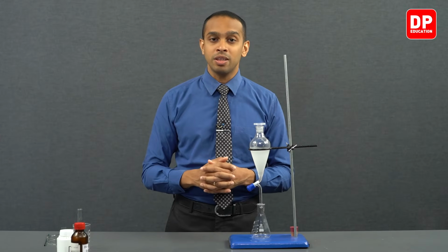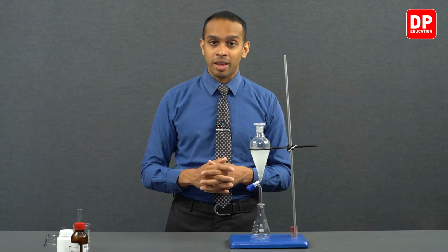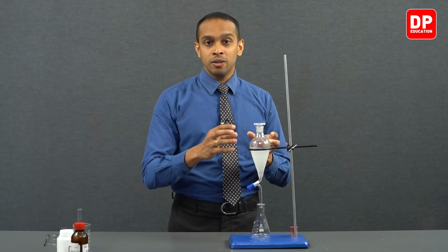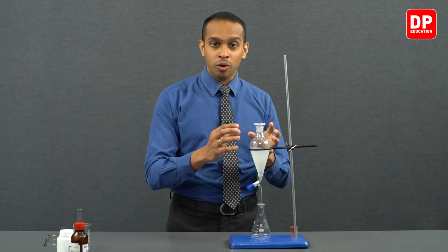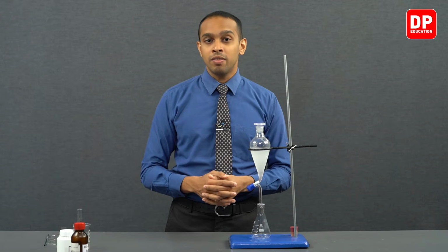Diethyl ether is a nonpolar solvent, and this nonpolar eugenol, or the essential oil that we have produced here, will dissolve in our diethyl ether. So through this solvent extraction process, we can extract the oil that is now mixed in water into an organic solvent such as diethyl ether.